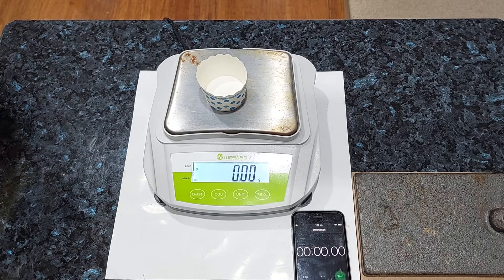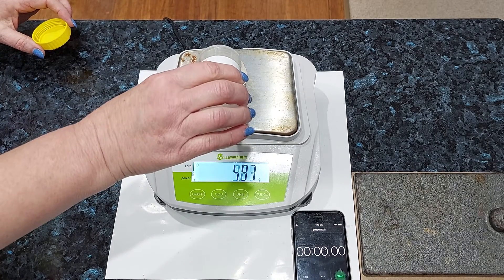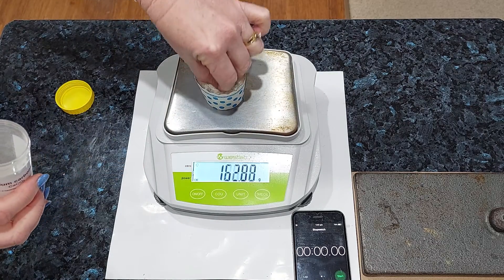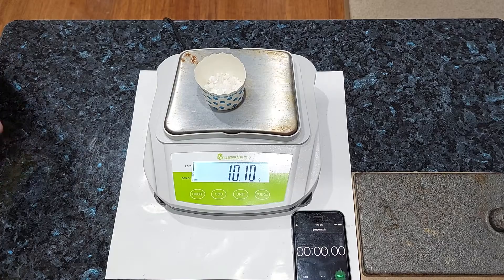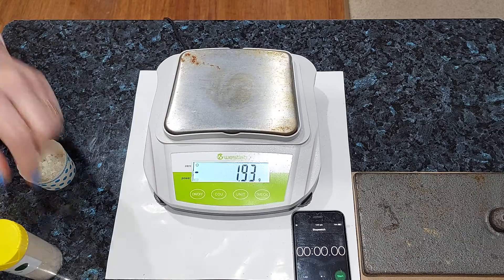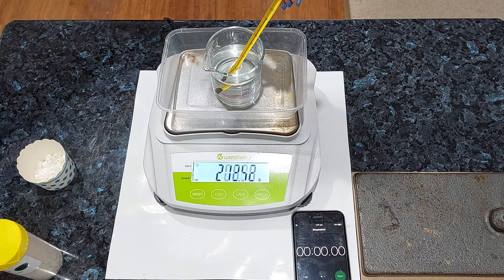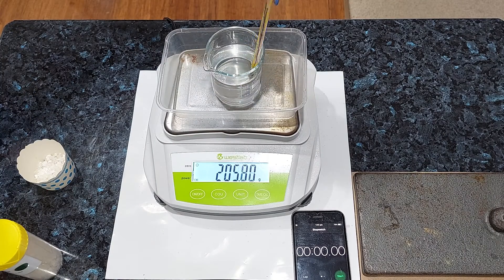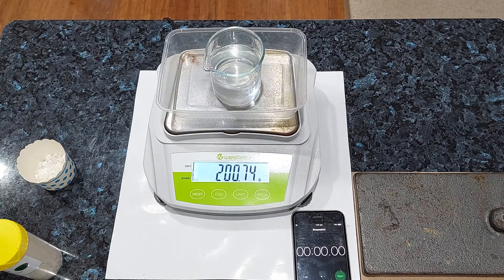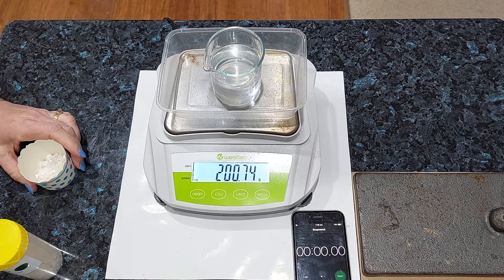Now we're going to use the acid that I've been keeping in the fridge. Again, weighing out our 10 grams of marble chips — a little bit too much, let's take some out. That's lovely, 10.1 grams. We're going to add that to our starting mass. Balance protector on. Our acid this time is at 10 degrees Celsius, so make sure you note that down — 10 degrees Celsius for this one. Here's our starting mass — add your 10.1 grams from the marble chips and we are ready to go.